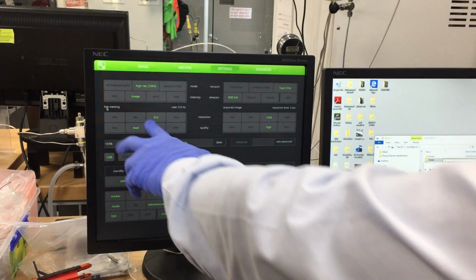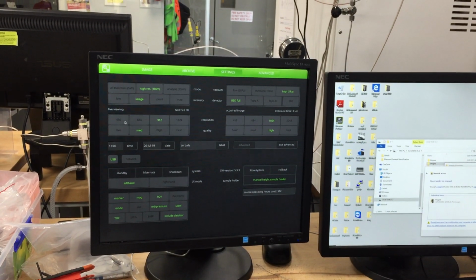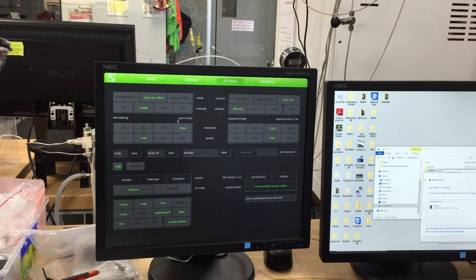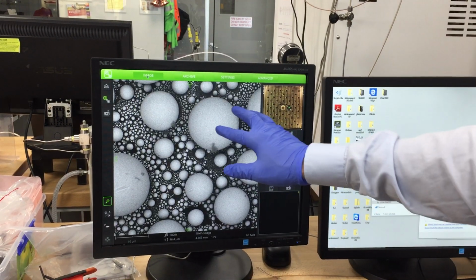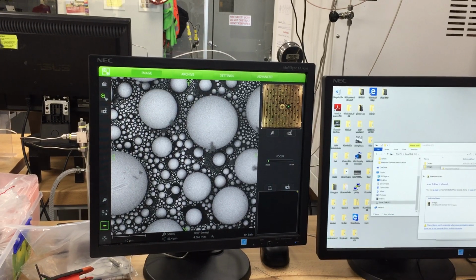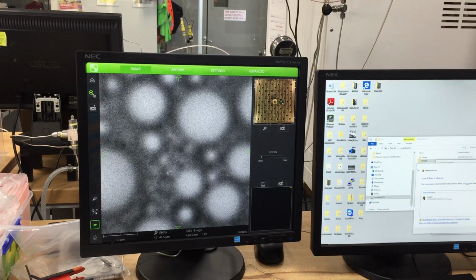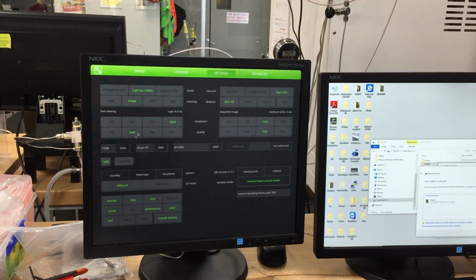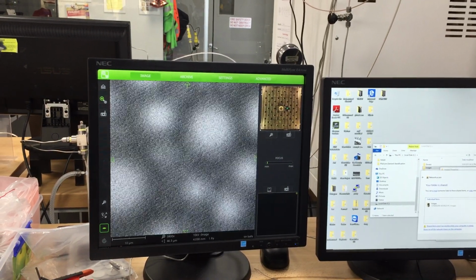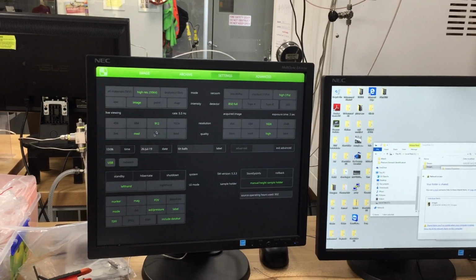And then you have the live viewing. So how smooth the image you want to see. This is how many pixels. This one is the better one. You can choose that one. You will see that the image will be higher resolution, but when you come to adjust the focus, for example, it will be very slow to respond, and you may not like it. Some people don't like it. Some people want faster response, so they might even go 684. So when I switch it, it's very quick response. I think the good compromise is 912 and medium.